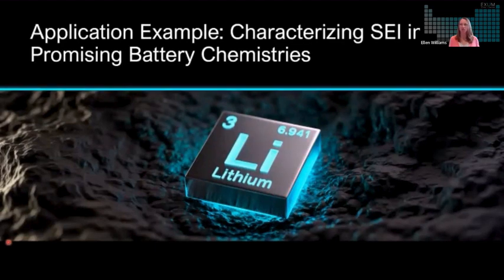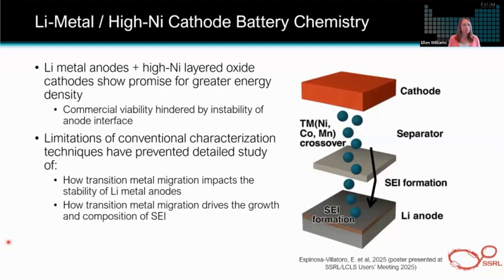how our technique was used to characterize SEI formation and a known amount of metal migration in a very promising battery chemistry, which is lithium metal anodes.